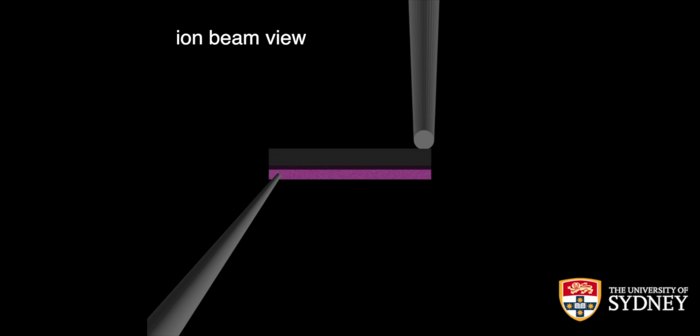And from the ion beam view, while you're doing the lift out, this is as good as it gets, because you are forced into the geometry to a certain extent. I would actually put up a special tutorial just on how to do the welds for atom probe samples. If you can influence your geometry and align your lift out piece or your weld perfectly to the gas injection system and produce a good geometry, that makes a huge difference in sample survival rates. And because it's so important, I will go into detail in an entire separate tutorial.